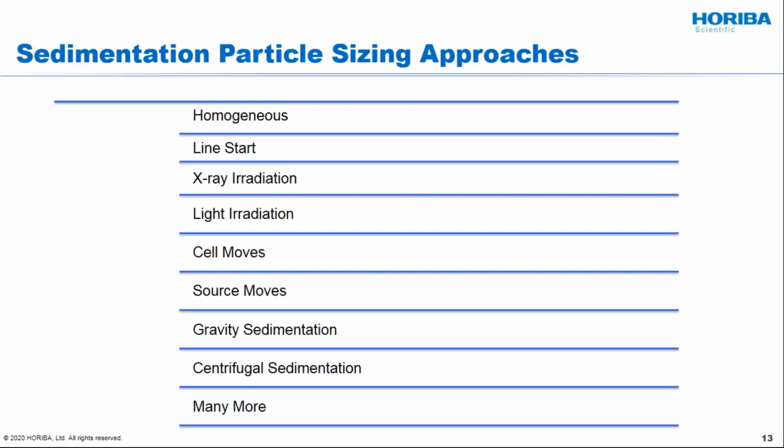and then measure them later. In terms of looking at your particle concentrations, now you have two different ways of doing it. You can use an X-ray, which is very good for inorganic type materials. You can use a light source, which is much better for doing organics, low atomic weight materials, which do not obscure the X-rays very well.